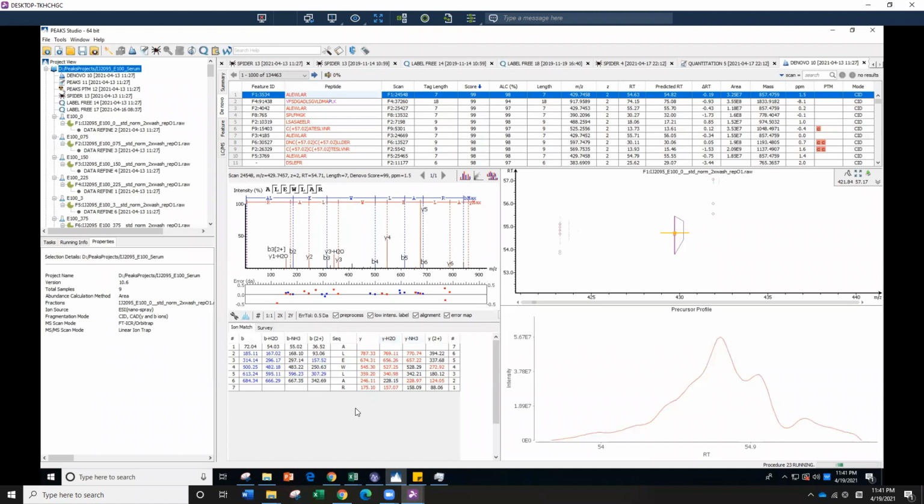That is how we are able to use the differences between peaks, calculate the difference, and find out which amino acid it is, and then we can piece it back together and make the peptide sequence there.